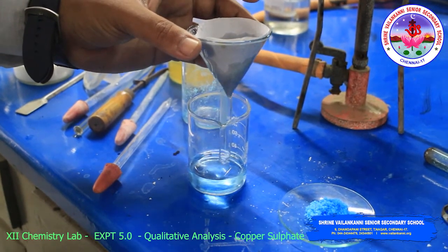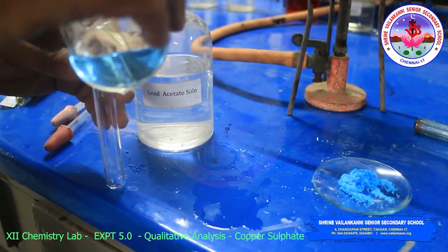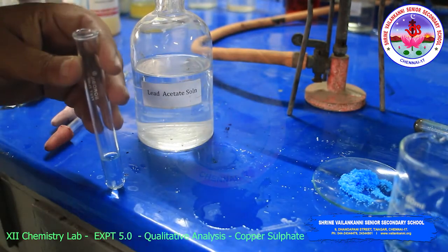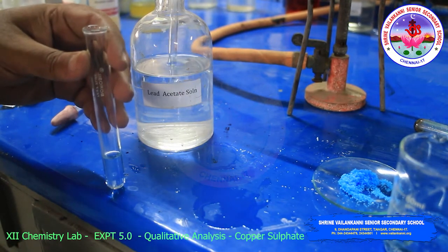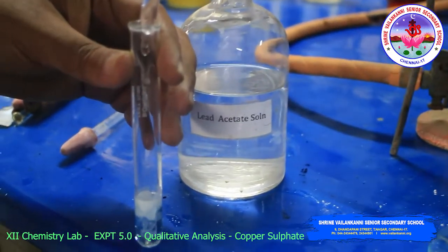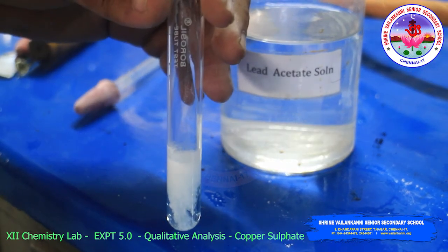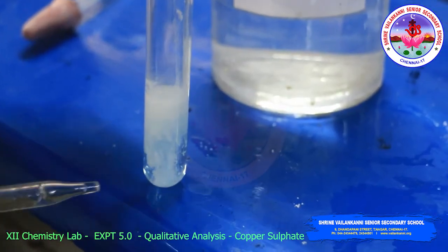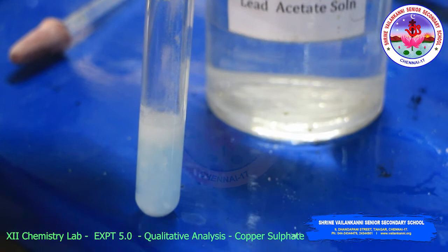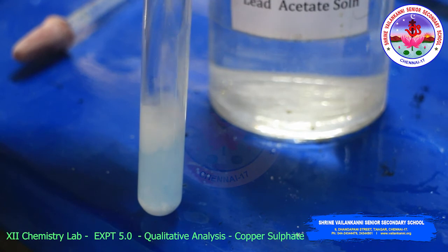Now we will perform the test. Take a few ml of the extract and add lead acetate solution. See, a white precipitate is obtained. So this indicates sulphate is confirmed. The white precipitate slowly settles down, on adding lead acetate solution. So sulphate is confirmed.